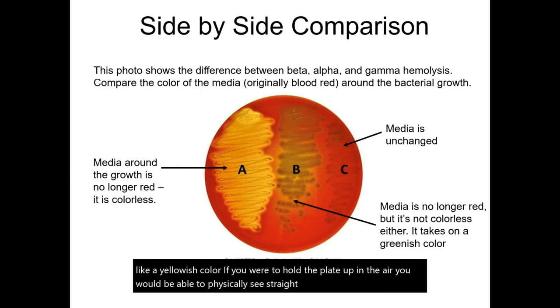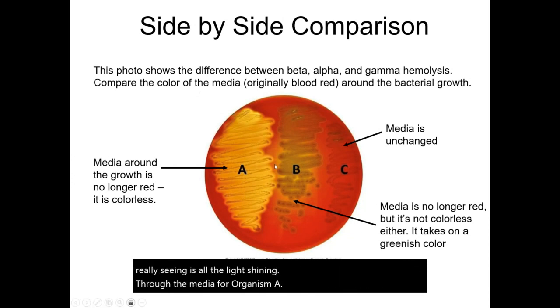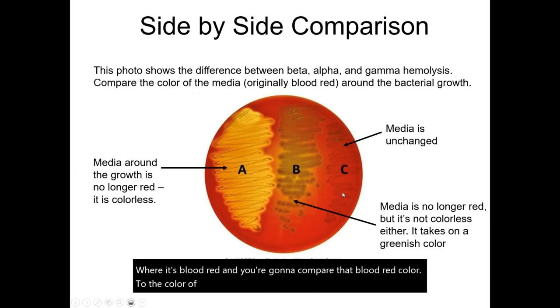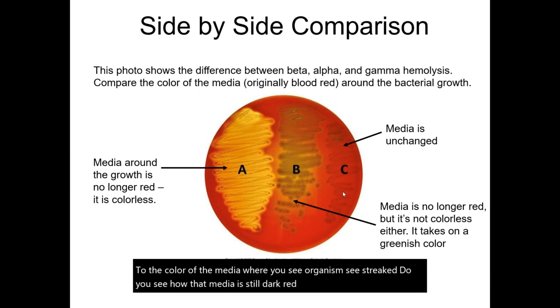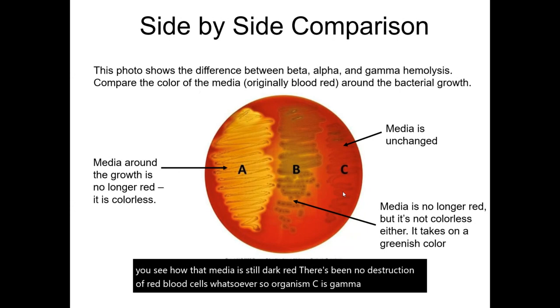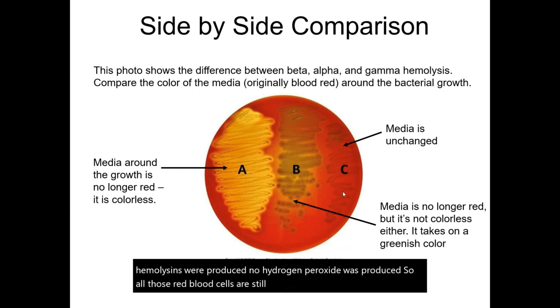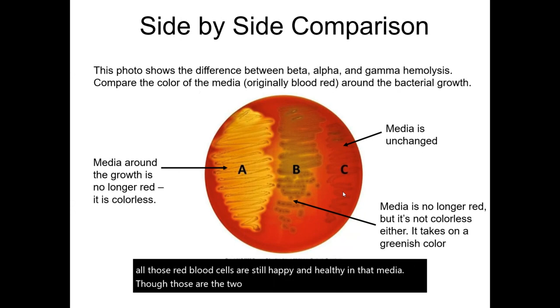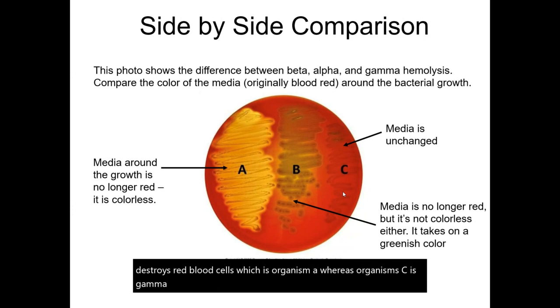This plate was placed on a light box, so you can see light shining through the media for organism A. Organism B in the middle shows alpha hemolysis, which turns the media a yellowish-green color — it's not clear, but it's not blood red either. It's somewhere in between, because hydrogen peroxide partially destroys the red blood cells. Beta hemolytic organism A completely destroys red blood cells, while gamma hemolytic organism C shows no destruction at all.